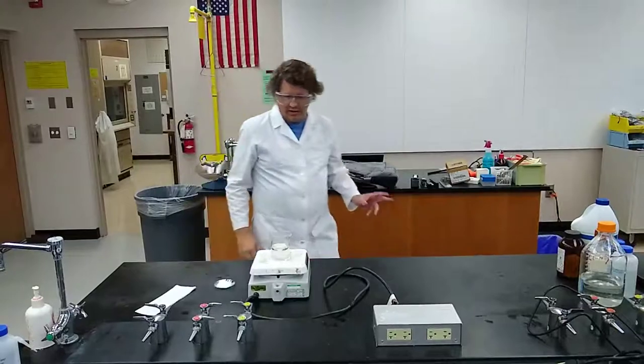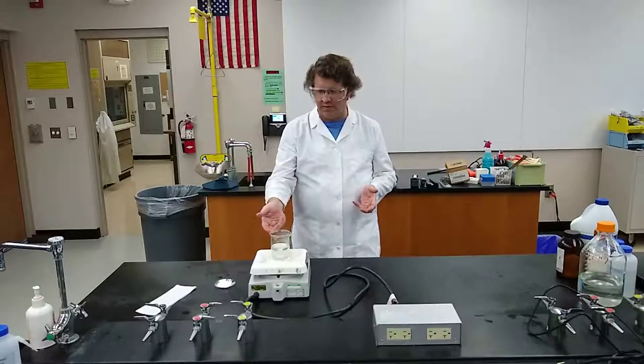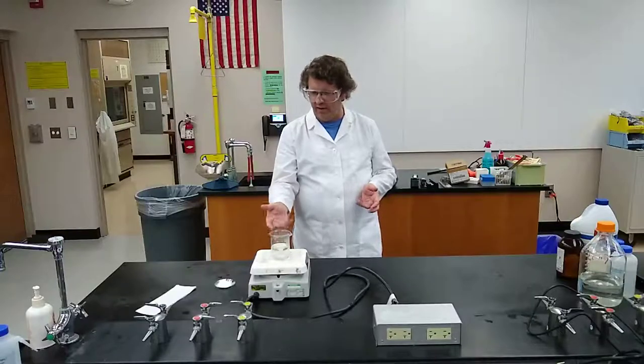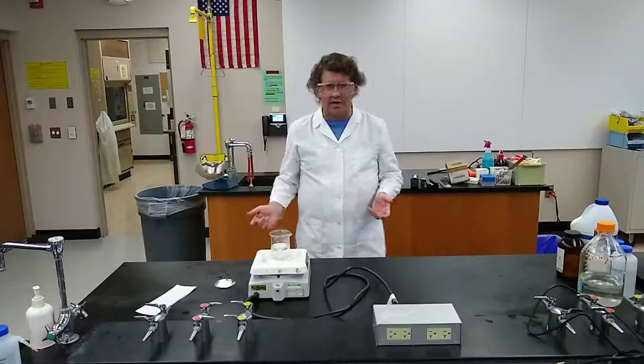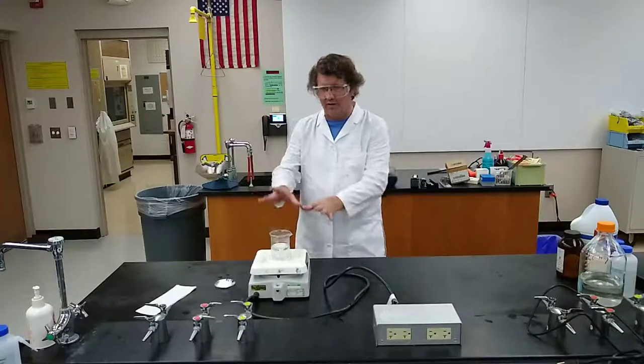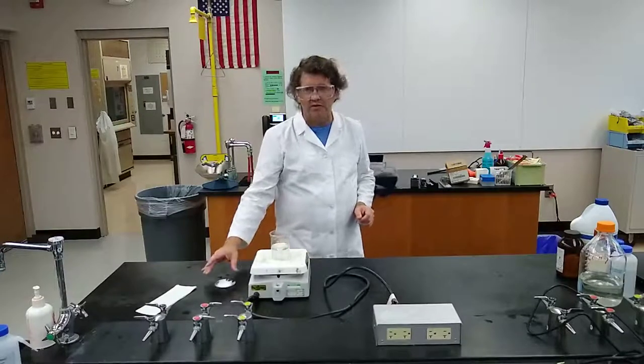The first thing I did when I got in here today is I got a hot plate out, got a 250 milliliter beaker with a stirring bar, and put a little over 100 milliliters of water in there. I just got it up to a boil as quick as possible. Right after I put it on the hot plate and turned it on, I went and measured out the five grams of starch.